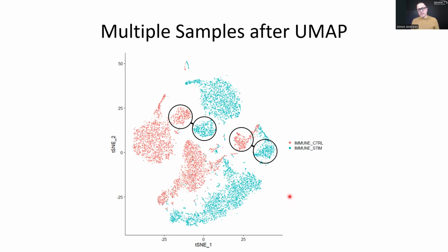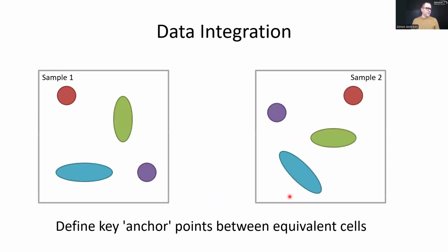The process that is used within the standard Seurat workflow is, if we take a very schematic view of taking two data sets that we've clustered out with our dimensionality reduction spreads, and which here I've colored by the cell type that the different subgroups have, we can see that although we separate out the cell types in each sample, they don't necessarily appear in quite the same place between samples because of the batch effects or biological differences between them.